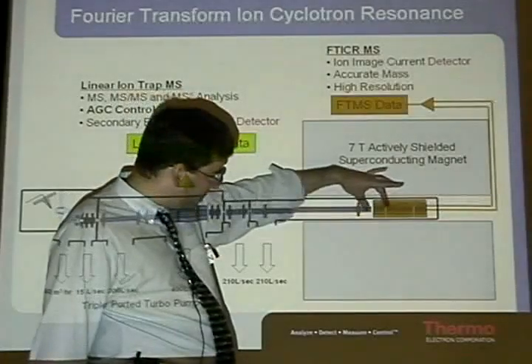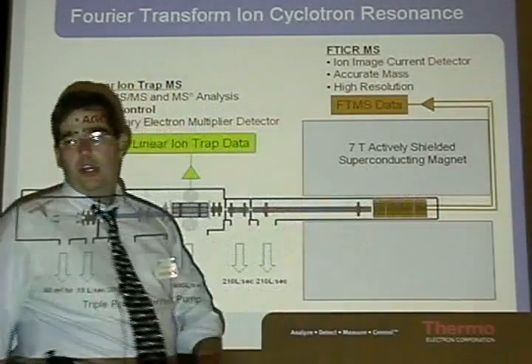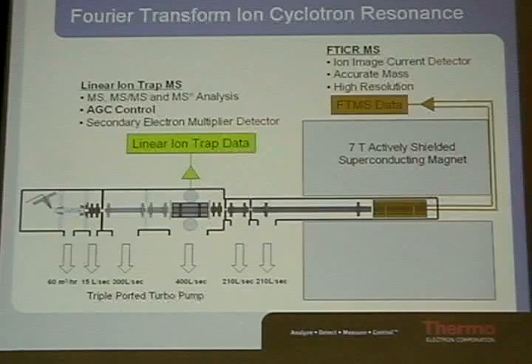When they come to the ICR, we have to recapture them. We can't capture the whole packet with equal efficiency. We can either efficiently capture the front end, the back end, or the center. So we're going to create a bias based upon shape. Does it make sense?